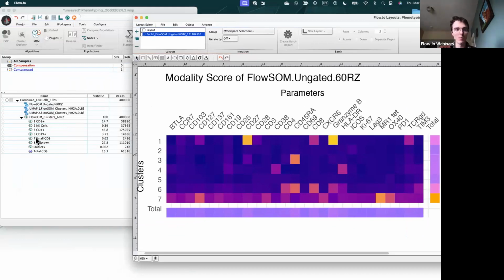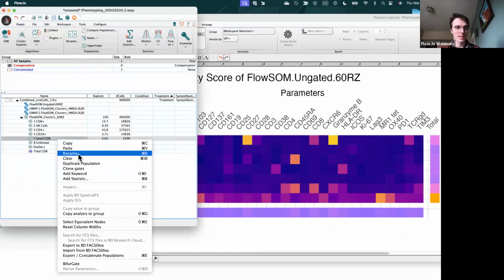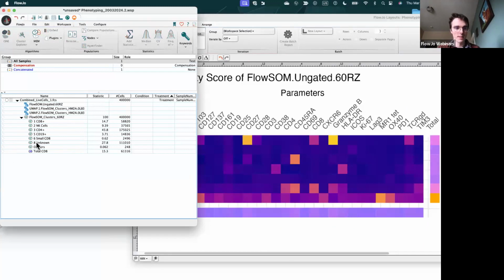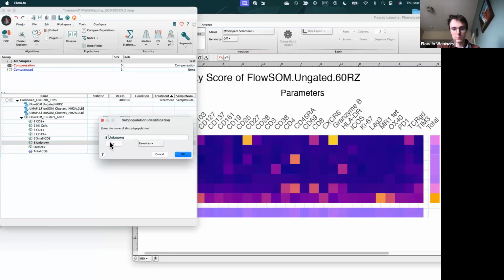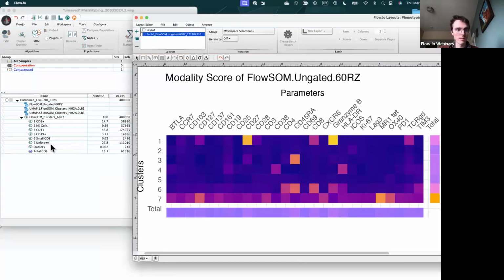That's why I went back and I relabeled these with the cluster number, although I definitely labeled it incorrectly. I skipped 6. So it should be 6, I think, and this should be 7. Okay. 1, 2, 3. Let me just double check I got the numbers right.